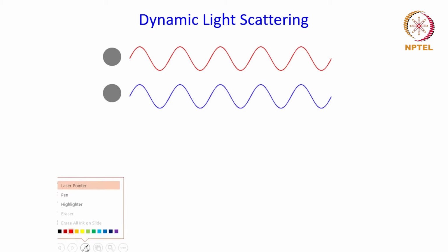So in this case, you can see that these two beams of light are in phase in the sense that positive to positive and negative to negative matches exactly as you can see over here, right? So these kind of waves are known to be in phase, and their intensity at any given point of time will be added to each other.